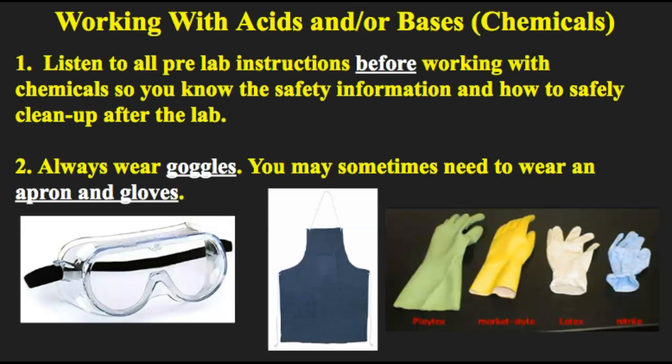For this part we're going to be talking about working with acids and/or bases. We'll generally just refer to these as chemicals to keep things simple. Number one, just like when working with fire and heat, the first thing to do is to listen to all pre-lab instructions before working with chemicals, so you know the safety information and how to safely clean up after the lab. Not only will you know how to clean up the materials but you also know where to get them from, how to safely mix them together, and we will review how much of the chemicals you should be using.